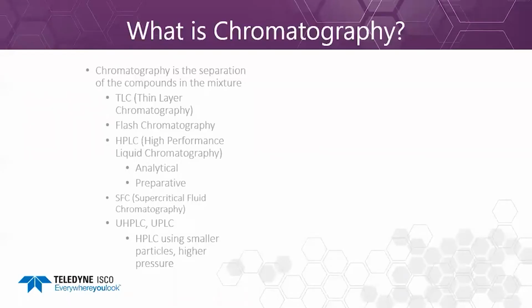UHPLC will not be discussed, and we will not discuss the finer details of chromatography, such as solvent modifier or loading technique. We will discuss solvent strength and use this later for correlation to extraction solvents. For natural products, TLC is used, flash, HPLC, and now supercritical fluid chromatography.